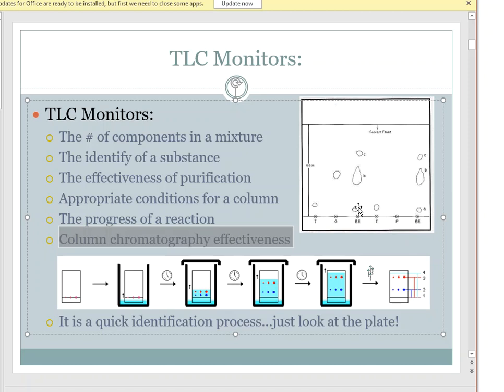And then finally, in the last lane of EE, that's the same as this EE. And if you compare and contrast, you see the bottom spot about the same. You see that the B spot is about the same shape as well. And then you see that the C spot is about the same distance and about the same shape as well. So that would lead me to believe that sure enough, this thing does have three components at least, and maybe more, depending on what happens to this B blob, right?